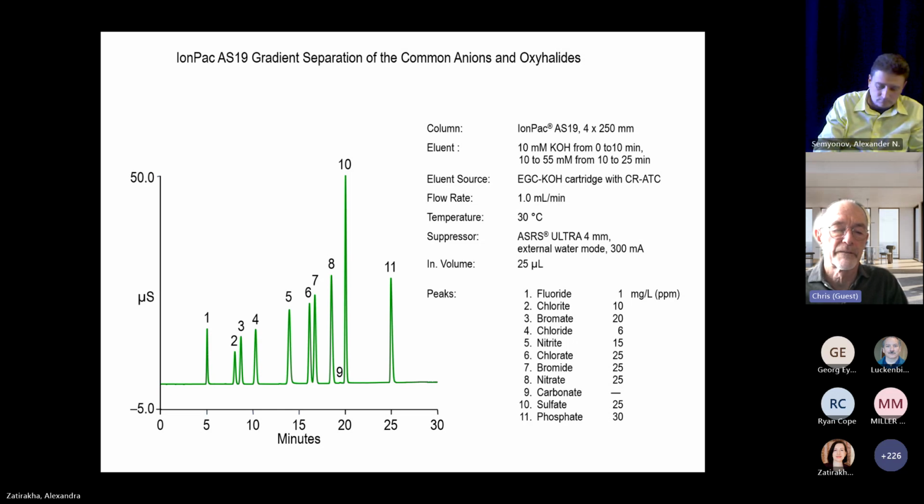Most of the phases that I'm going to show you next use somewhere between 2 and 4 reaction cycles, but more where a reaction cycle is treatment with a diepoxide and treatment with amine. Some of them have a different amine for the last step, but a lot of them use just 2 reagents, the diepoxide and the amine of interest.